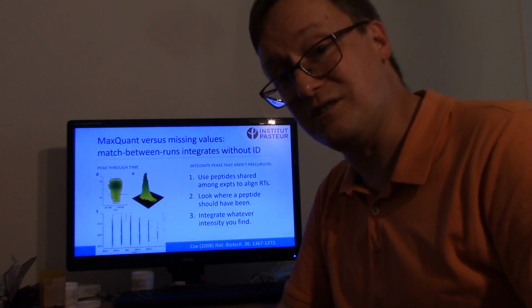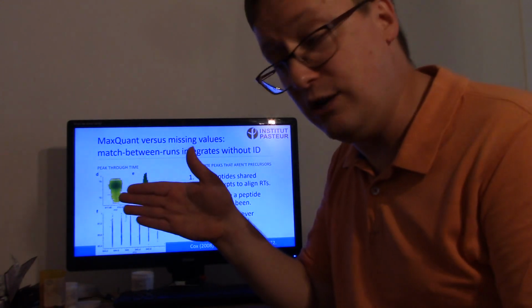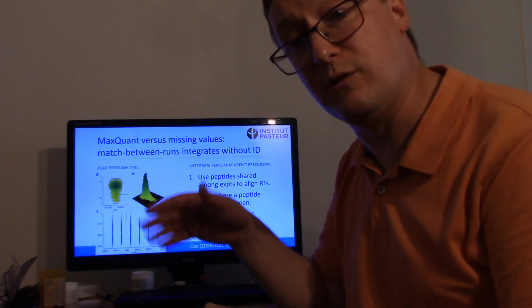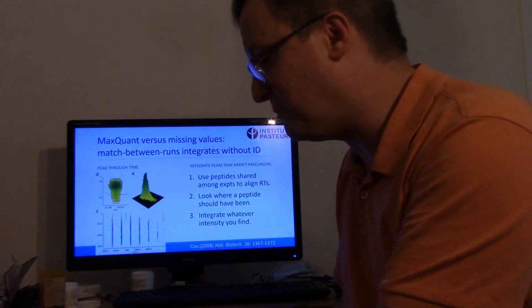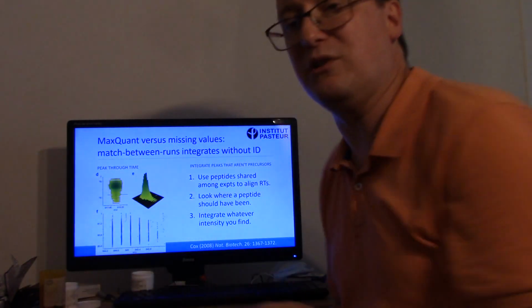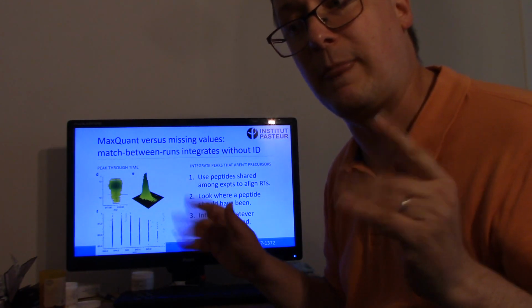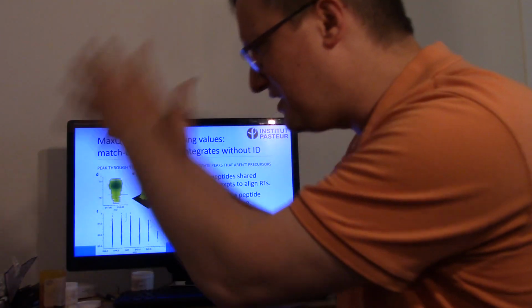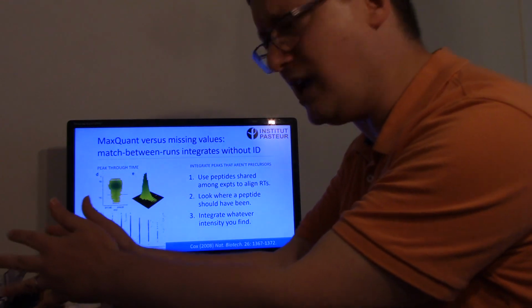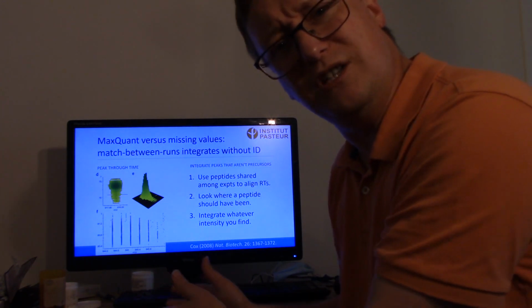The answer is, in all the other experiments, you knew the order in which identified peptides appeared. You've got the identifications. You can simply say, well, a peptide with this sequence appears here, a peptide of that sequence appears there, and you can track this across all of the experiments you're analyzing. And then, when you want to ask, gosh, I saw this peptide show up in experiment A, I want the intensity for it in experiment B. How do I do that?